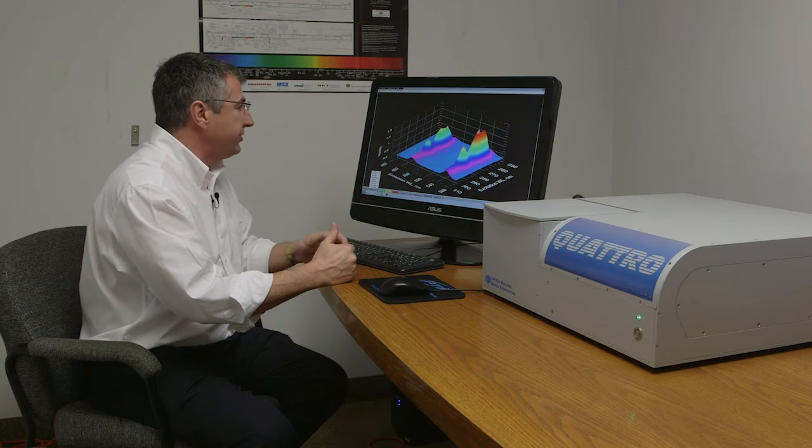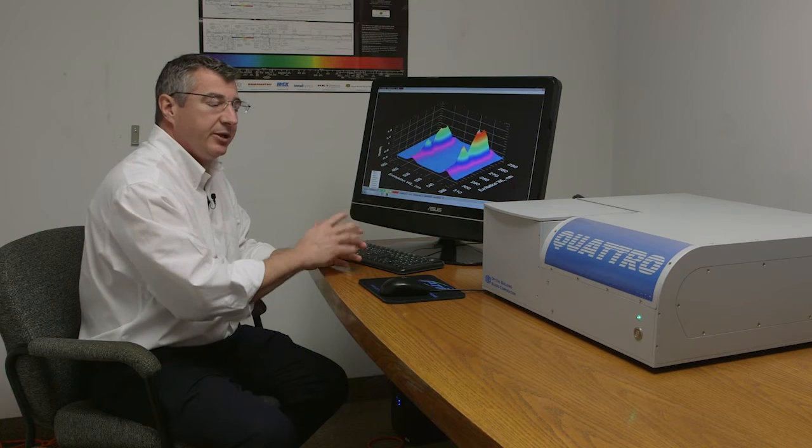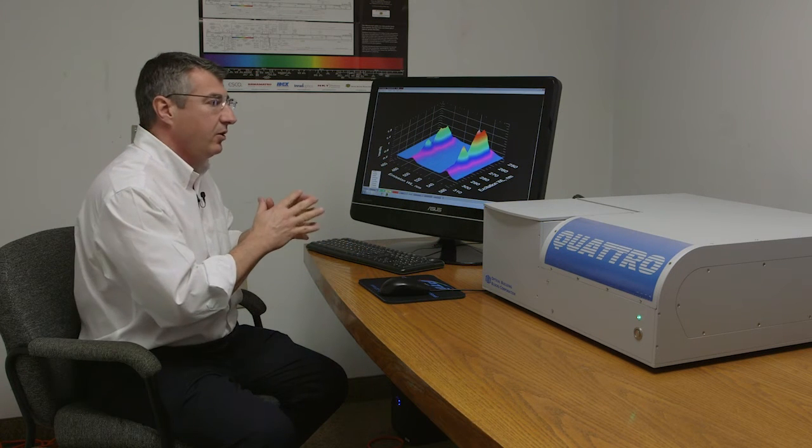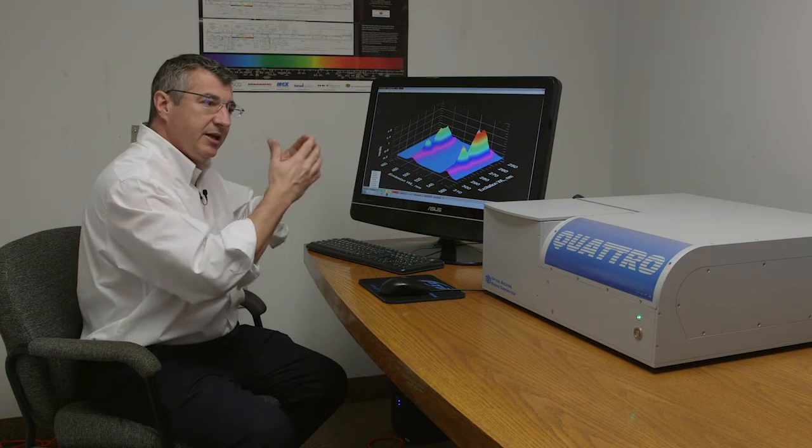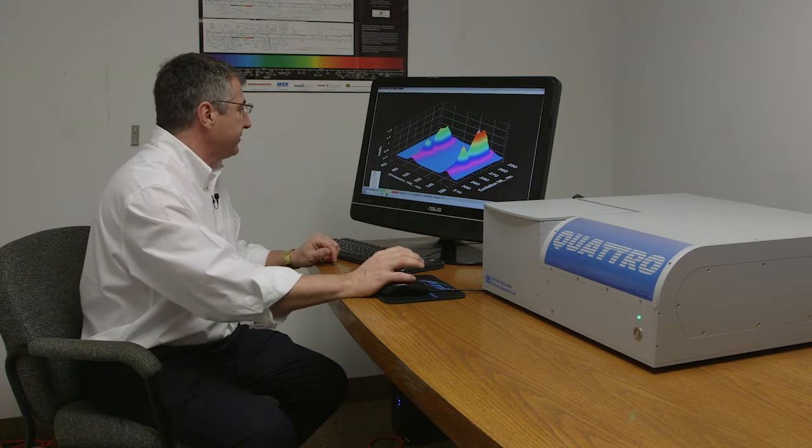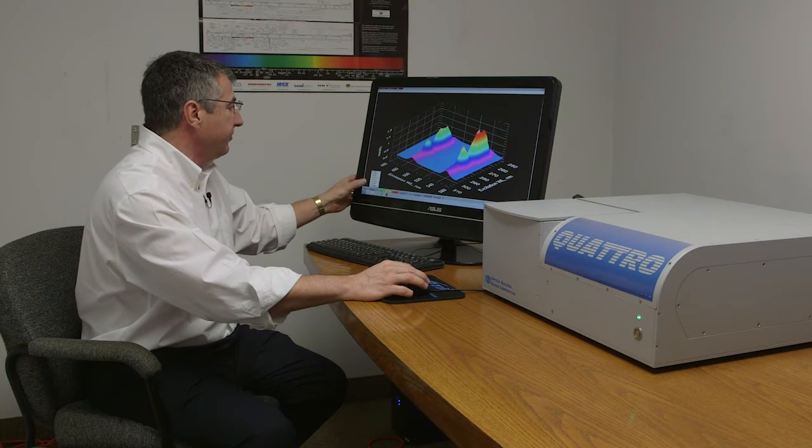It's also able to do time domain based studies so we can measure phosphorescence decays, measuring how long the sample stays in the excited state before it drops down into the ground state. Again as well we can see here the ability to do three-dimensional mapping, spectra against spectra, spectra against lifetime, virtually anything that the customer might choose to do.